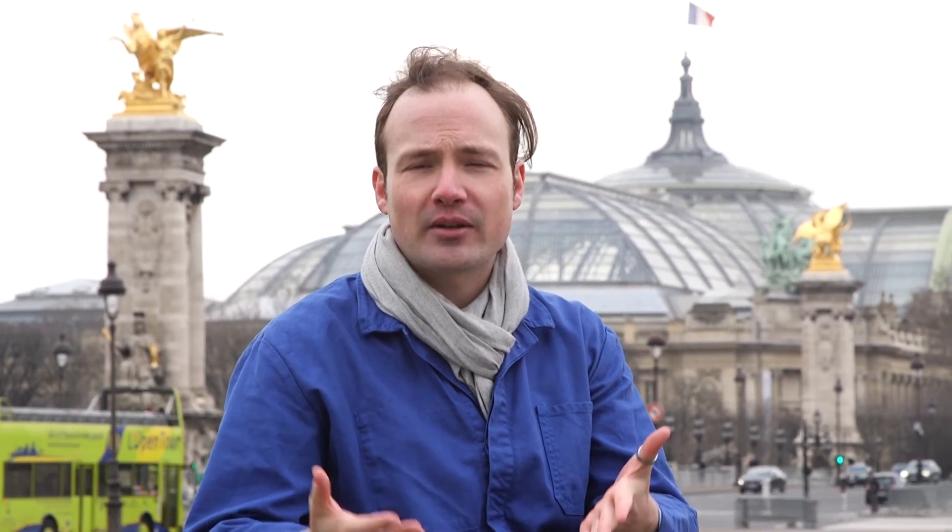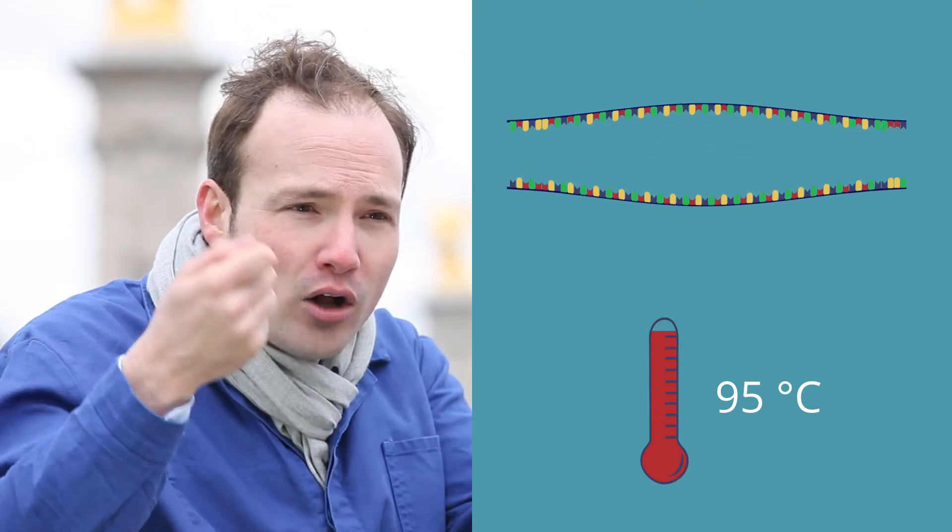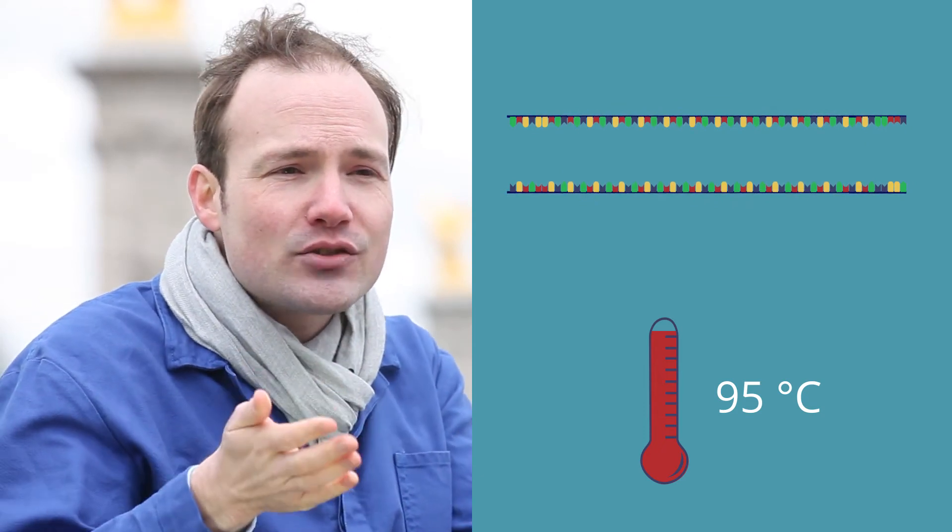A thermocycler is just a machine that can heat or cool our test tubes to a programmed series of temperatures. By cycling through a series of temperatures, we can get the DNA to replicate over and over again. First, we heat everything up to 95°C, near boiling. At this temperature, the DNA double helix melts, and all of the DNA becomes single stranded. This is why we needed that fancy thermostable DNA polymerase from the hot springs.